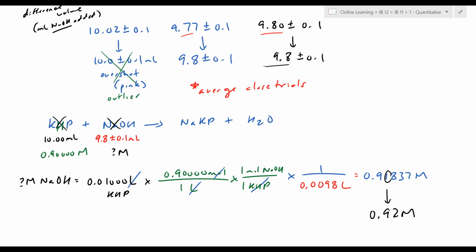So what I want to show you here is that's how we sort of work our way through a titration. I showed you on the virtual simulation how we actually collect the numbers. I'm going to follow this up with another tutorial just to finish off the other titration. You can just do that for a quick practice, just to rehash your technique and then see if you can practice the stoichiometry yourself.